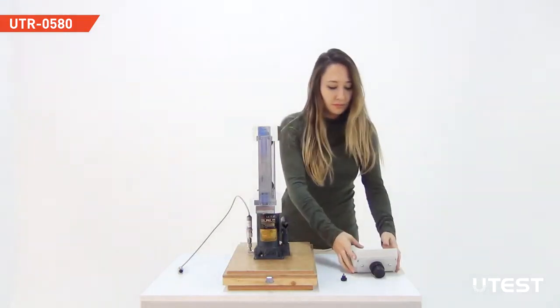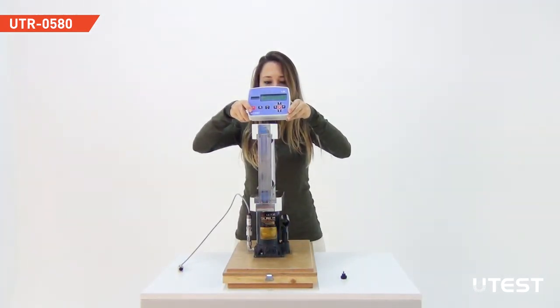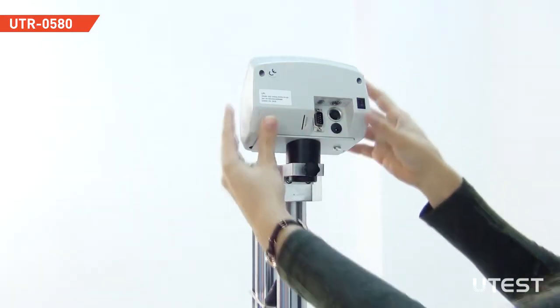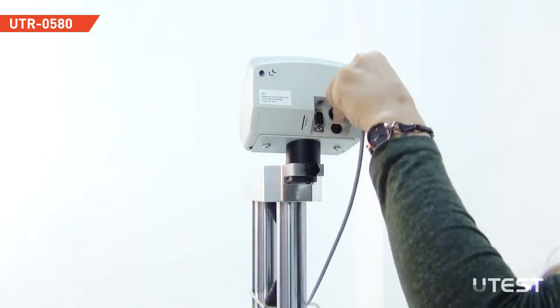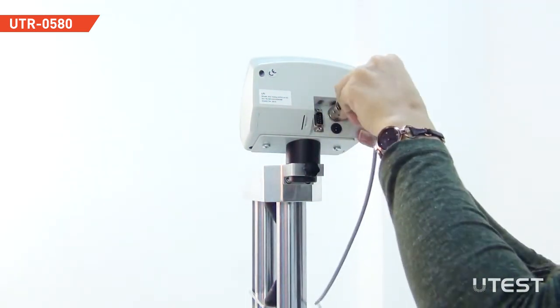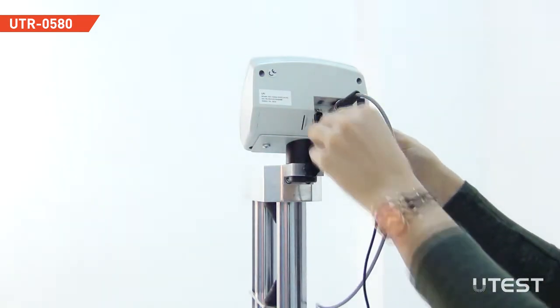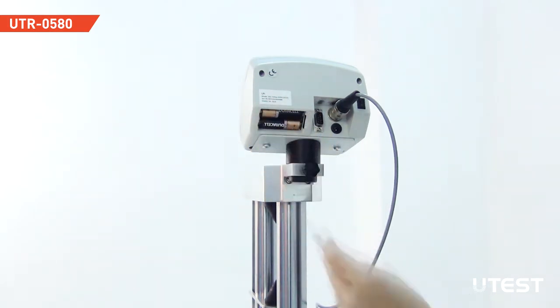Mount the digital unit to the loading frame and fix it by tightening the nut. Connect the 5-pin plug of the transducer to the socket at the back side of the digital unit. Plug in the power cable. The digital unit can also operate with double AA batteries.